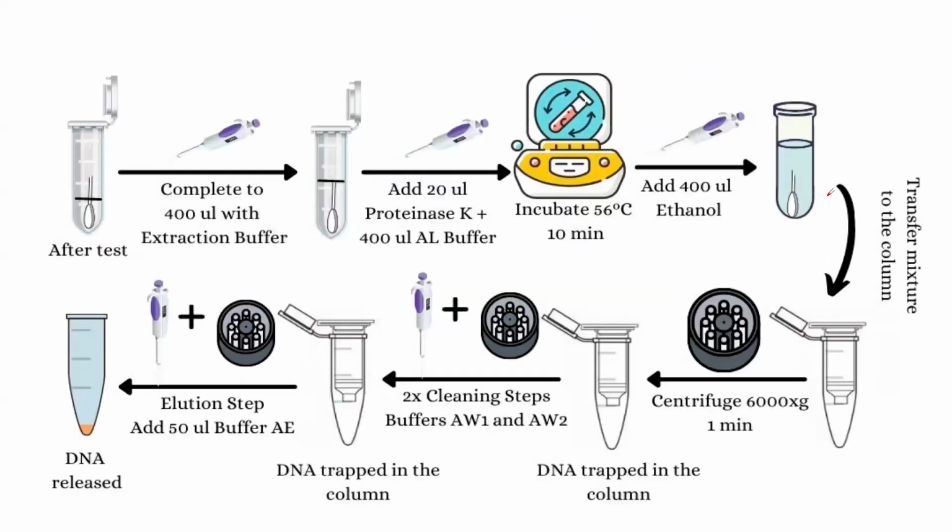There are also other methods to extract DNA, and that one is usually done with kits. We have what we call a DNA extraction kit. The DNA extraction kit is used with the manufacturer's instructions. There is a template, usually, when you buy the extraction kits.